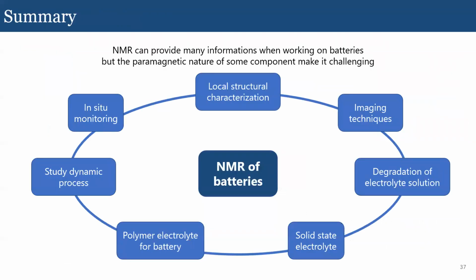And with that, this is just a summary of what I was talking about, and I'm reaching the end of my presentation. Sorry for being so long. I hope I managed to show you that NMR is a powerful technique and it can provide valuable information when you're working with batteries. This can be applied to a large variety of systems and can give you different information, and you have a large variety of methods to get there.